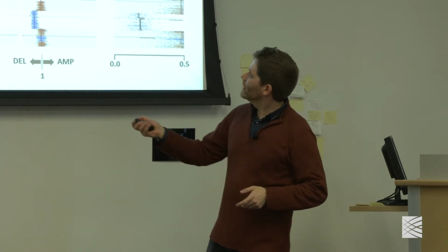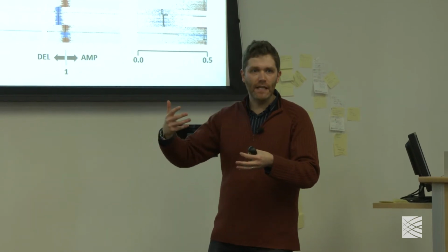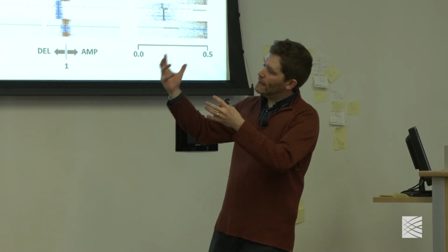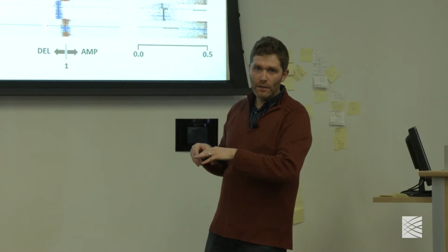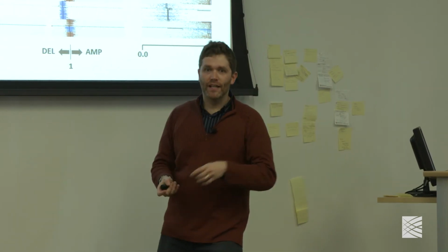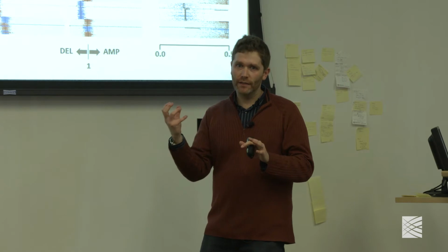Essentially what's happening here is we now have a copy ratio estimate that is essentially just in units of the median in the pond. What we did before, when we created the pond, is we basically did an SVD to capture a hyperplane using the normal samples. You're with me so far? Now, you can take your case sample and project it into that hyperplane. And there's a nice, fast linear algebra trick to do that.